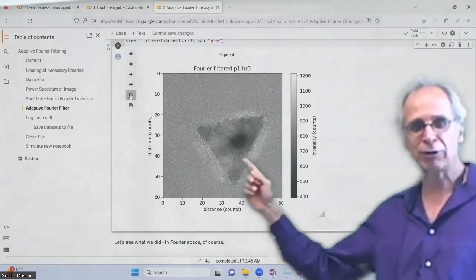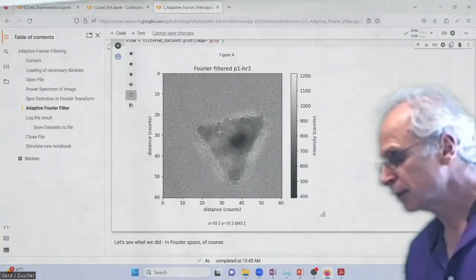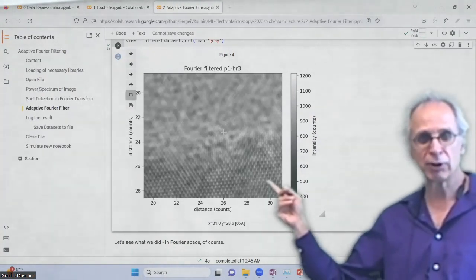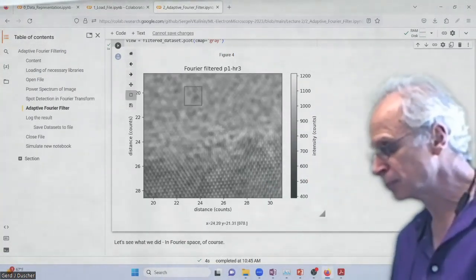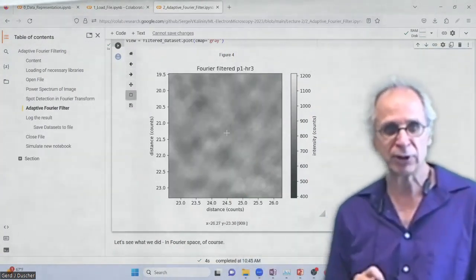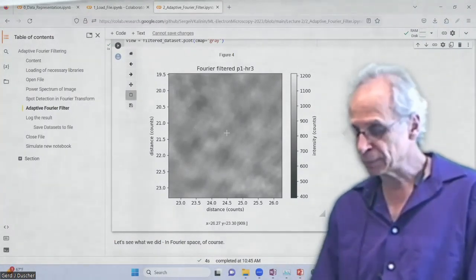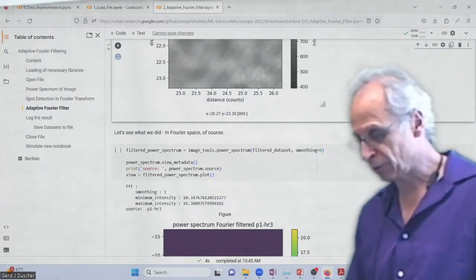I did it now in grayscale, whatever. But let's look here. Zinc oxide, very nice, right? So we can definitely do something with that. And if we zoom in to anywhere where the graphene is, we see actually now also the graphene. And most people stop there, but you shouldn't, because we learn things, right?